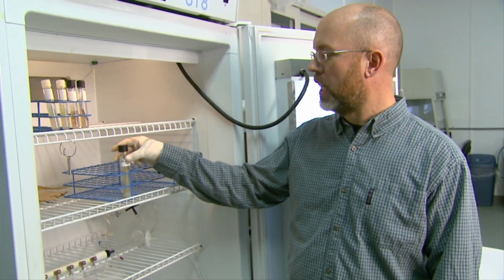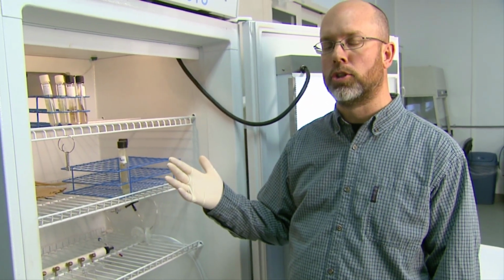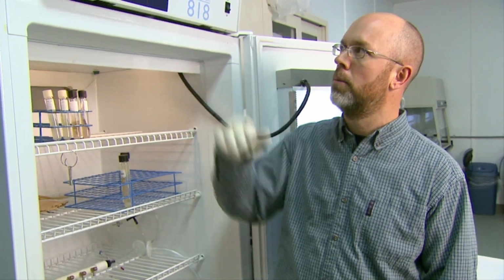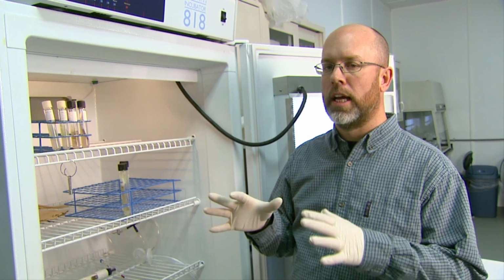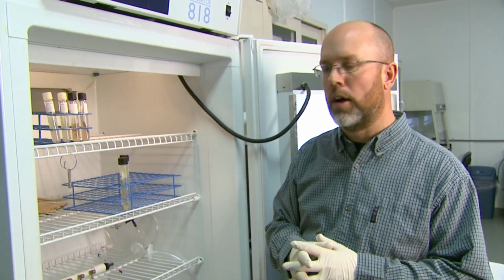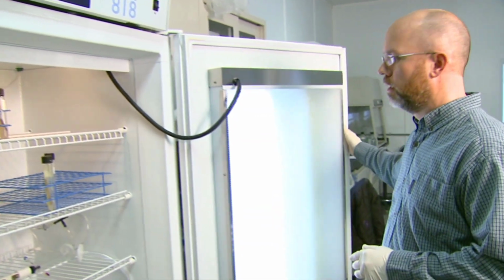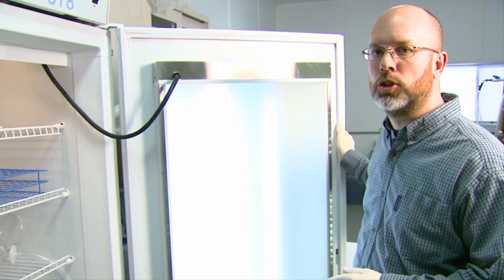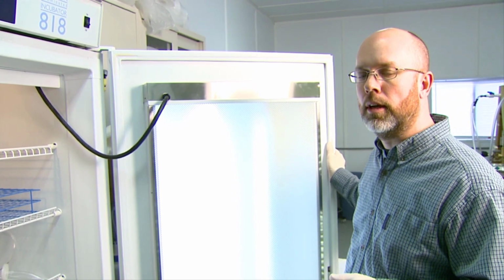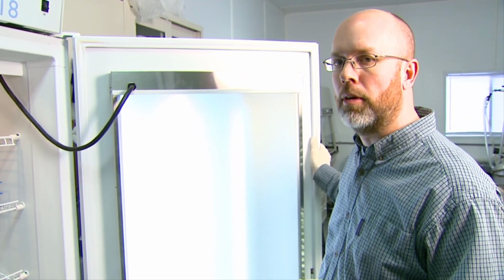So we keep our slant cultures and also our flask cultures in this temperature controlled incubator. The reason we do that, we can keep the temperature, you can see we keep it at about 18 degrees C. That just allows the cultures to grow slowly and stay nice and healthy, and they don't outgrow their container. It also provides a very nice light source. So it's just a very controlled environment. And anytime you have these early cultures before you step it up even further, it's nice to have a temperature controlled environment for them to grow.